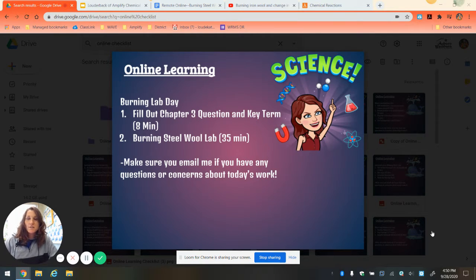What we're going to do today is another burning lab, and this has to do a lot with Chapter 3 question and key terms that we're going to fill out here soon. And then we are going to burn steel wool in the class.